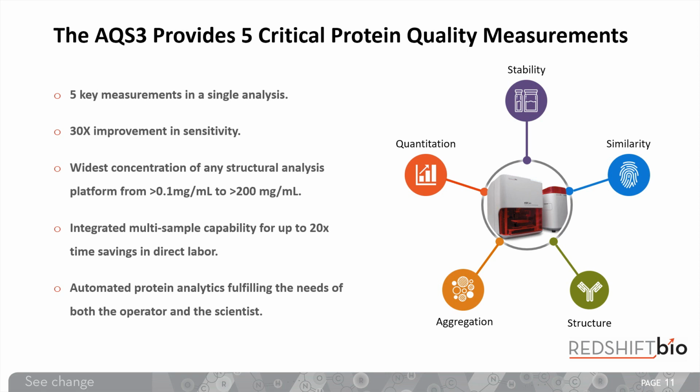I'd now like to hand the webinar over to Alex from Pressure BioSciences, who's going to introduce you to his system and then show some examples of how the AQS3 Pro can be used to observe protein structure under pressure.